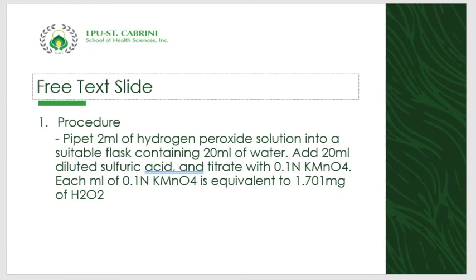The pink color of permanganate is distinct when a drop in excess of that required to oxidize all the sample has been added, okay? Although the agua oxinada, or your hydrogen peroxide, generally acts as an oxidizing agent and is reduced to water, in this assay, it reduces the potassium permanganate while it is being oxidized to oxygen. Okay?